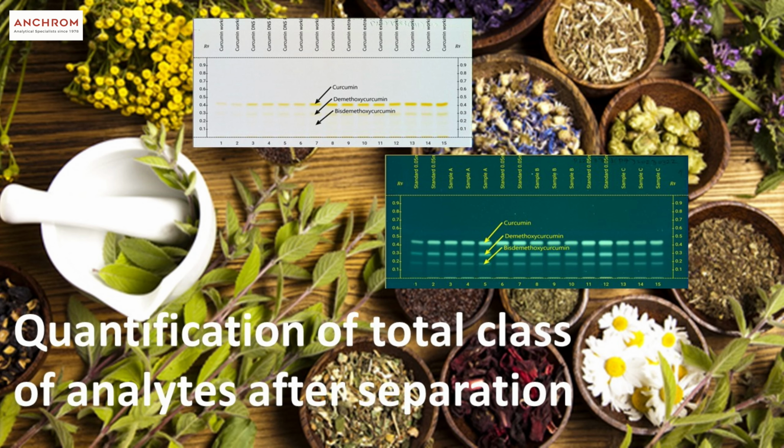By using the Assignment Mode feature, visionCATS v4.0 software ensures precise and flexible quantification of multiple zones together from different samples.